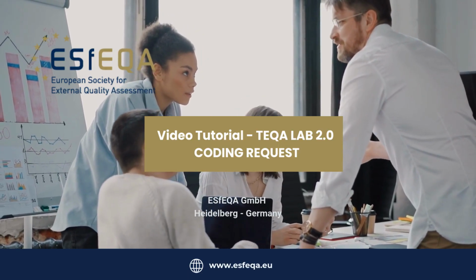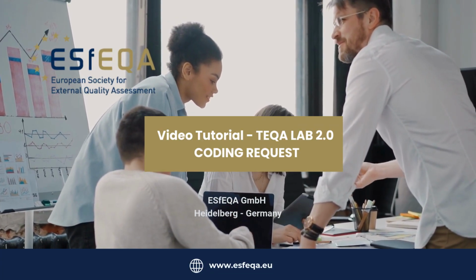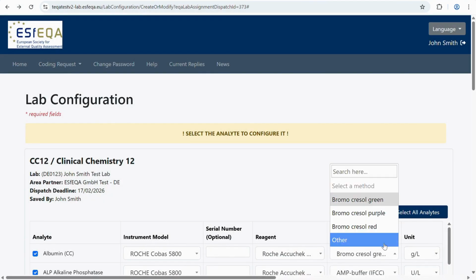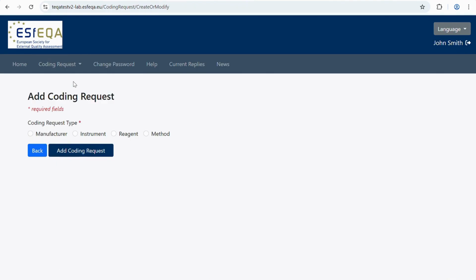What should you do if the manufacturer, instrument, method, or reagent you need is not available in the drop-down menu of TEQA 2.0? You can either choose Other, or you can submit a coding request for it. For this last option, click on Coding Request and then click Add Coding Request.